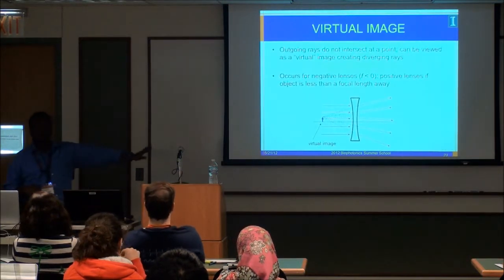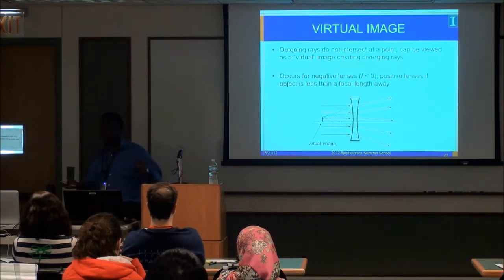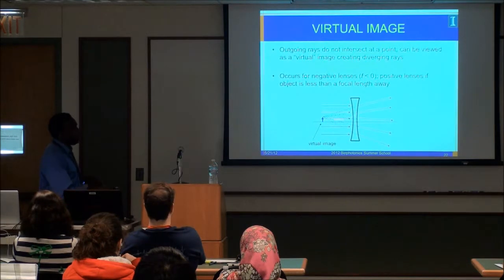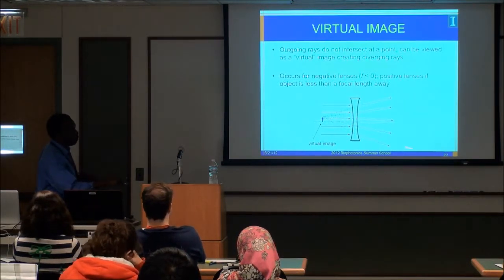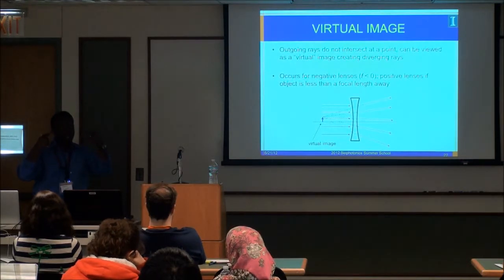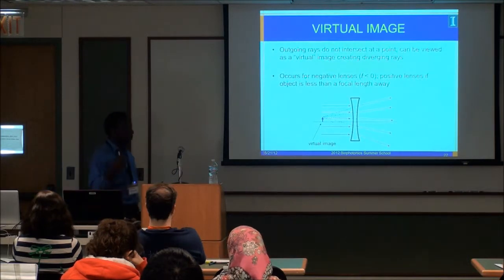This goes back to geometrical ray optics, whereby normally when you have a lens, we think of the lens taking the incoming rays and focusing them, but that's if it's a positive lens, or if everything's in focus. But if you defocus, in a sense, or depending on where you are relative to the object, or if you have like this biconcave lens here, then what you have is your divergent rays. And you do that because you have one last lens pair, which is the lenses in each eye, okay? Which is going to refocus them back so that your brain can process the image.